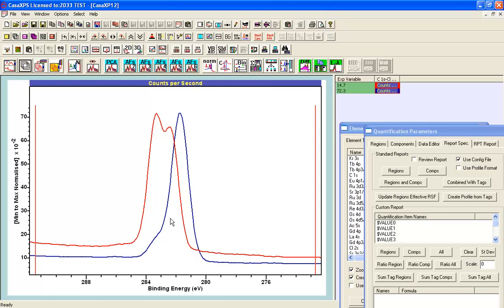Well, the answer is that I believe that as part of this degradation of PVC, we will see some HCl created. Now that can be created just by heating PVC. So there is certainly a significant chance that we've got some kind of HCl within the material, no carbon bonded to Cl, so there might be some Cl without any correlation with carbon. But I suspect that I've included in this blue component an element of both the HCl and the carbon that is still bonded to chlorine. But we can definitely see that the carbon has arranged itself within this material after degradation, where it's just carbon bonded to carbon or carbon bonded to carbon and hydrogen.